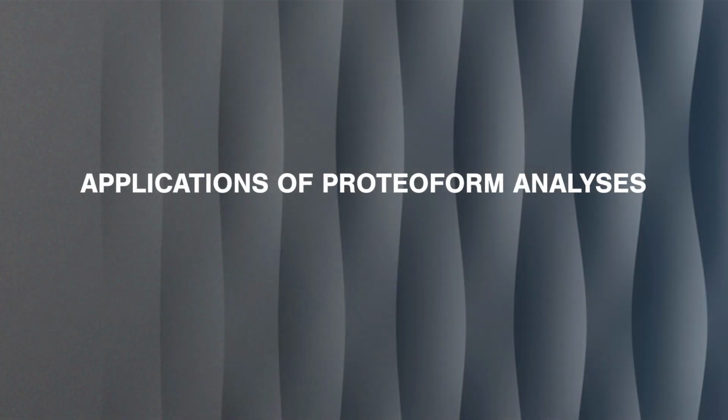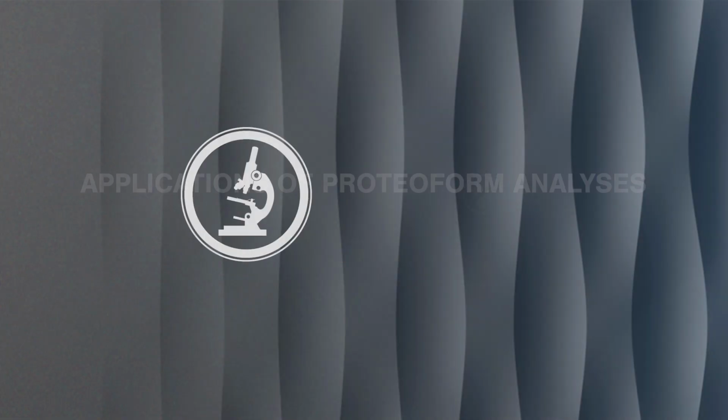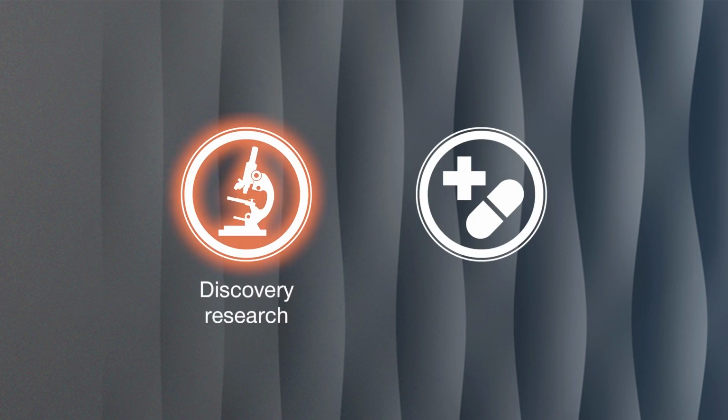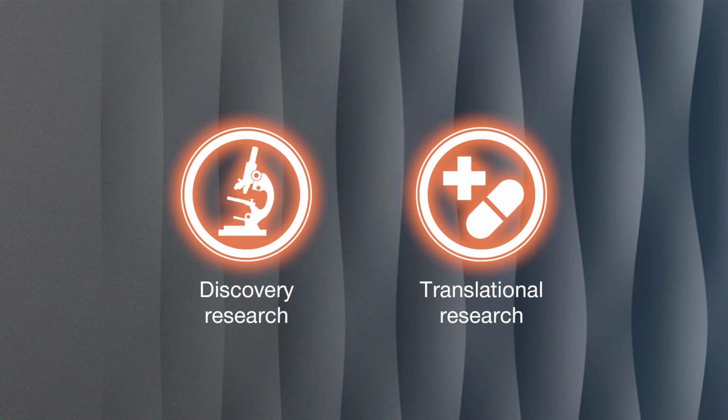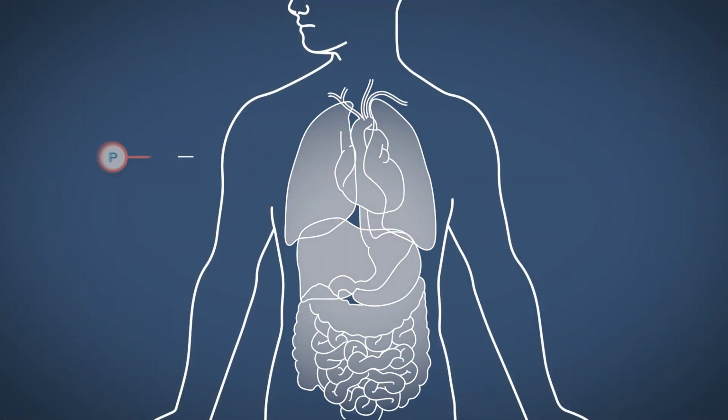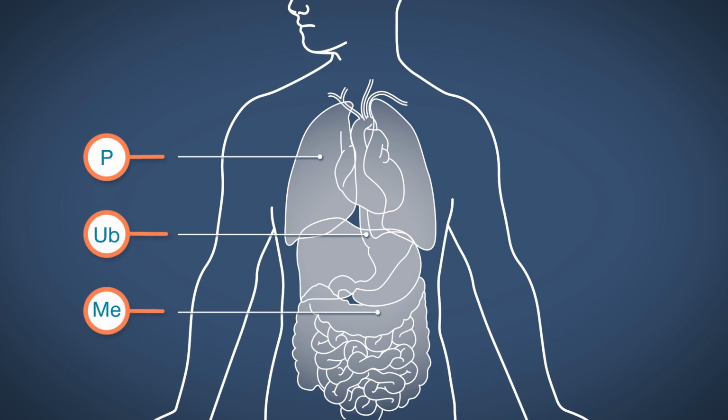Applications of proteoform analyses. There are many reasons to study proteoforms. We highlight discovery research and translational research here. First, studies show that different tissues express different proteoforms. To gain a real understanding of how tissues function when healthy, we must acquire a far more in-depth understanding of proteoforms.